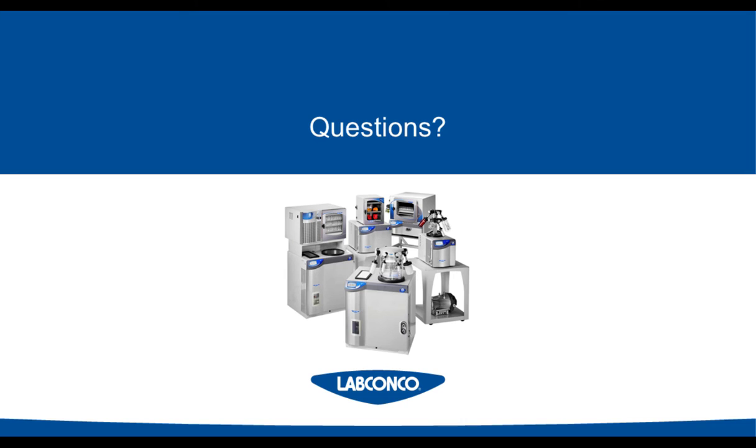Thank you. And what is the name of the accessory that indicates when flask freeze drying is complete? That would be our End Zone endpoint detection system. And if you have any additional questions about that, feel free to reach out to us. But like we covered in the presentation, it's really just the use of vacuum sensors measuring the vacuum level inside of the sample compared to a reference port on the manifold.